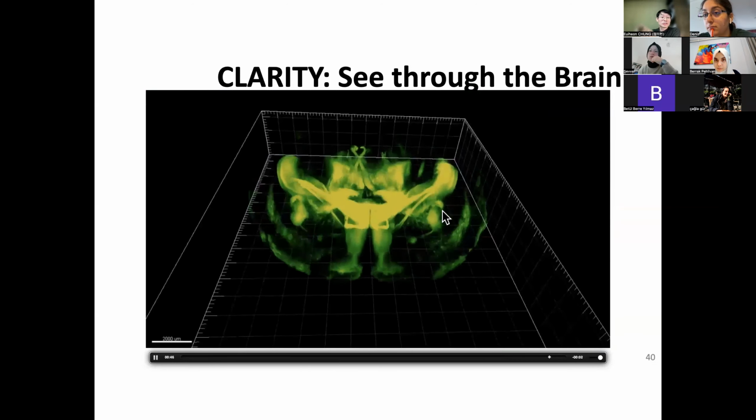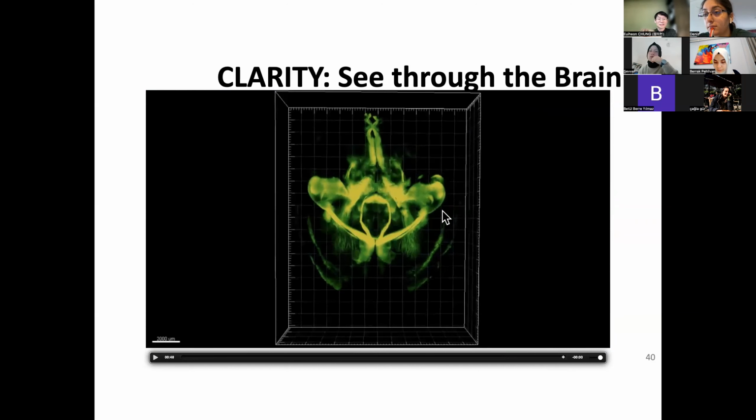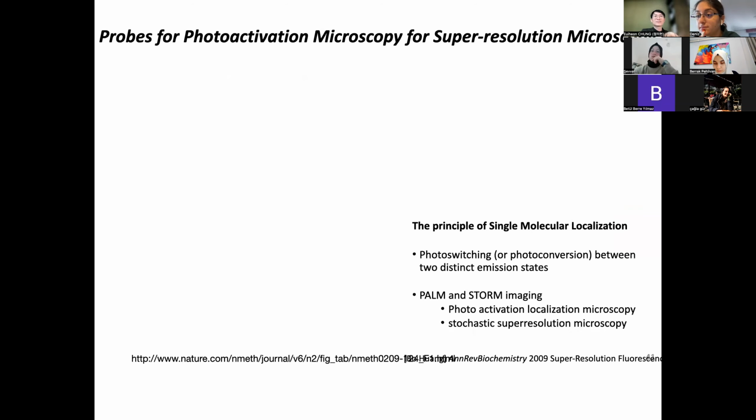I know you guys are interested in neuroscience, and the development of these technologies now allows us, let's say you're interested in Alzheimer's disease, to generate a hypothesis: where does the amyloid beta accumulation start? You could use this technology to find out whether amyloid beta starts to accumulate in one place and spreads out. Maybe this is the mechanism we may target. So important hypotheses can come out of this technology.